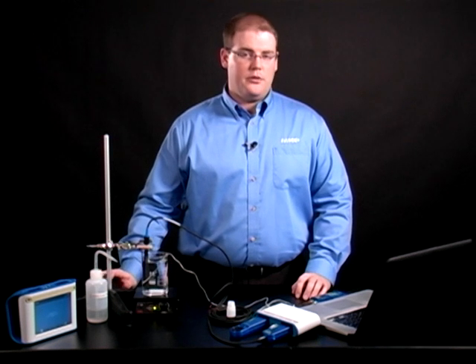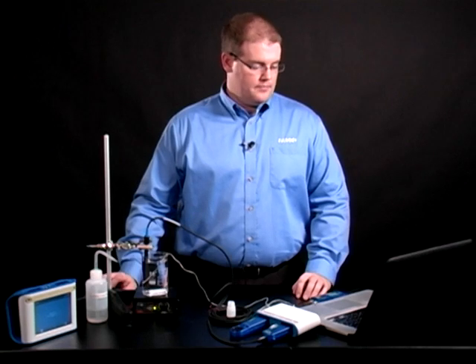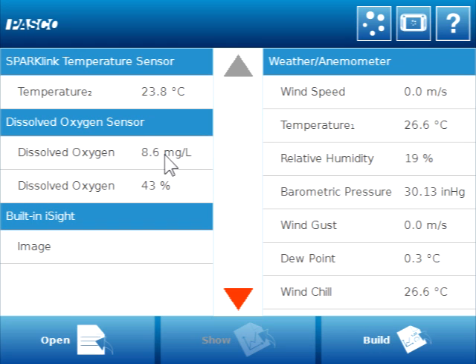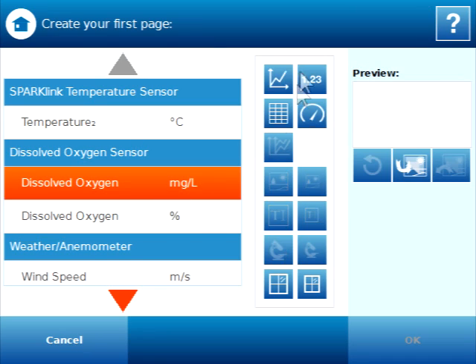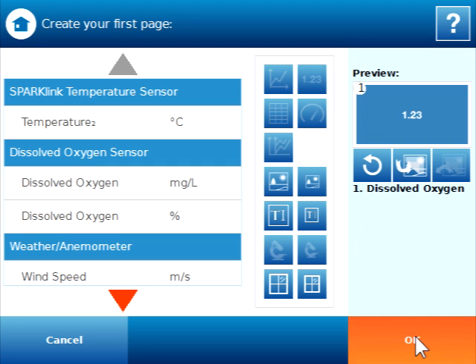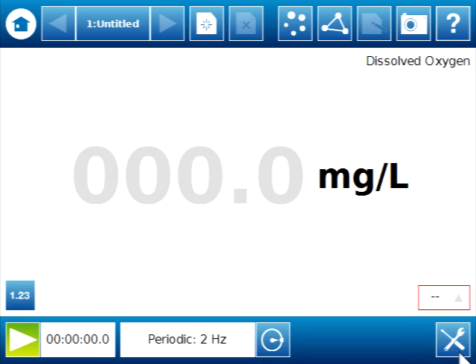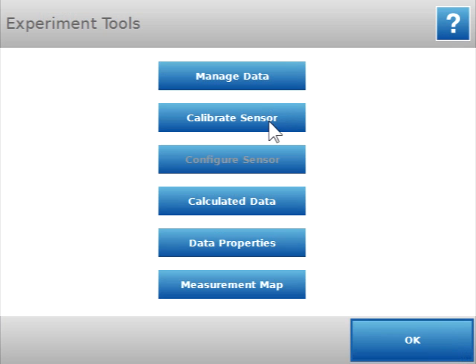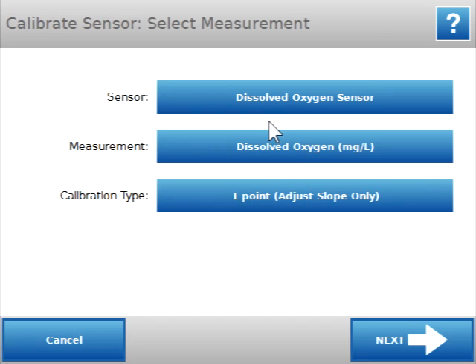Next, we need to open or create a lab file. I'm going to build a simple page with a digits display of dissolved oxygen in milligrams per liter. Next, we need to open Experiment Tools. Select Calibrate Sensor and make sure that the measurement dissolved oxygen in milligrams per liter is selected. Then click Next.